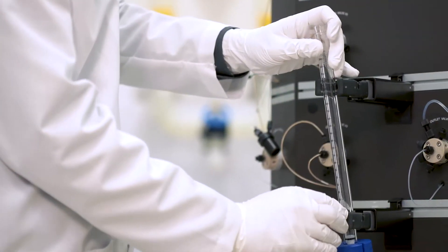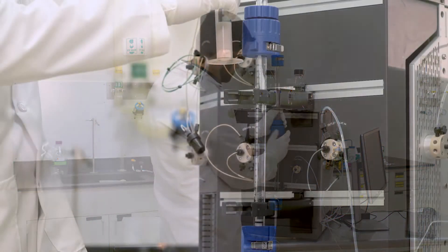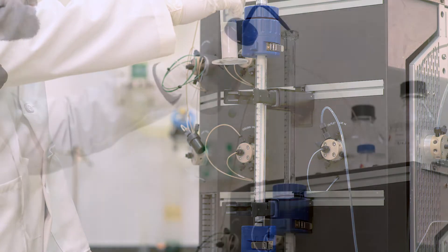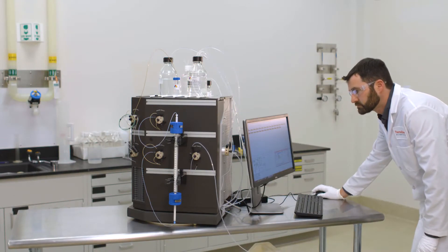This video will walk you through the process of packing lab scale columns of less than or equal to 100 milliliters with POROS resins. For this demonstration we will utilize POROS XS resin. The steps in the process can be used for all 50 micron resins with minor differences in the packing factor, which will be highlighted later.